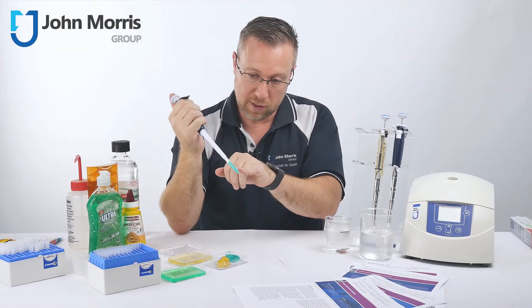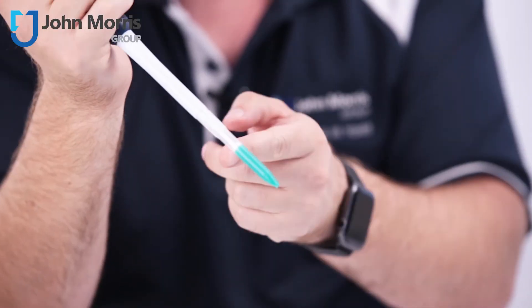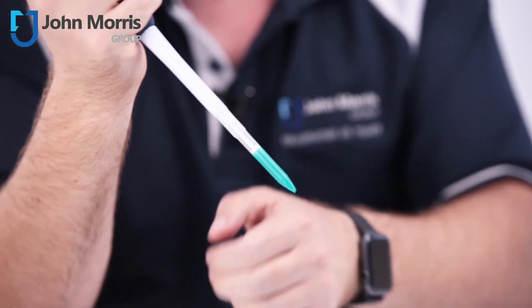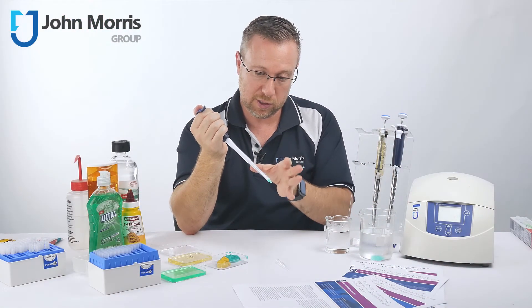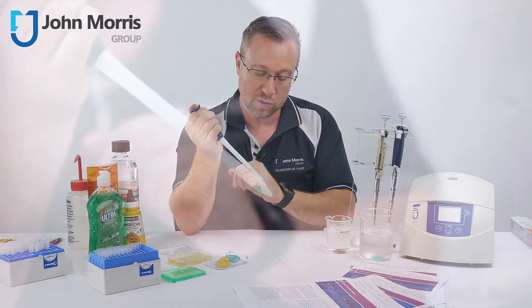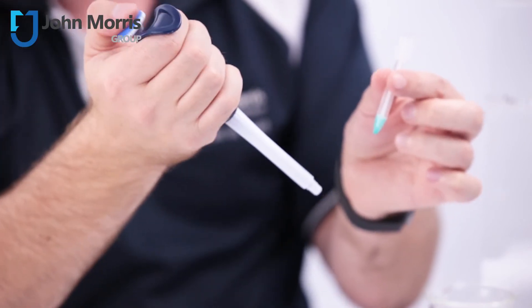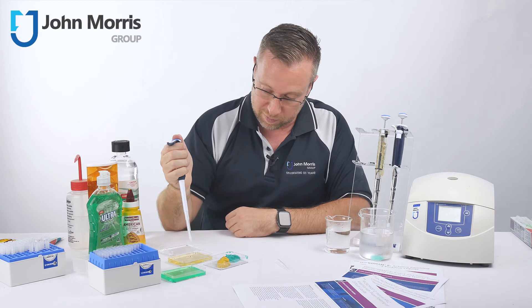You can see the gel is actually touching the tip on the inside — there's no gap. The neat thing about these tips is that because they're designed to handle biologicals, if you just click down they come straight off, so you can literally fire them directly into a bin. Let's try that soap that we found so hard before.